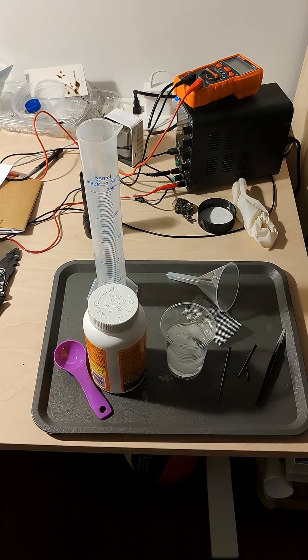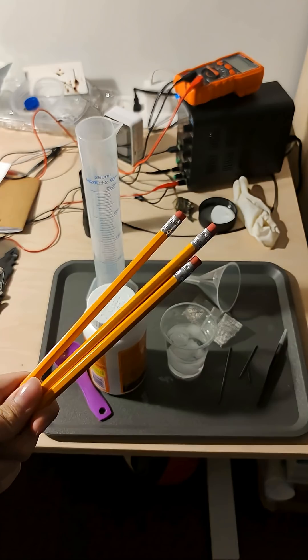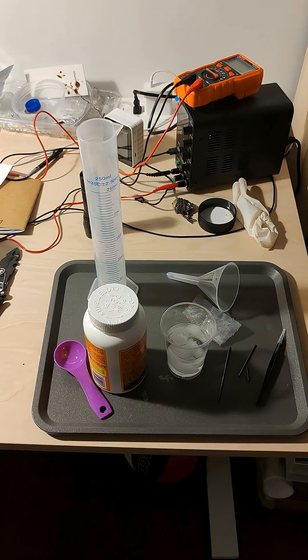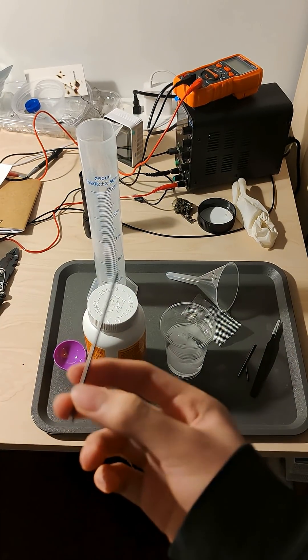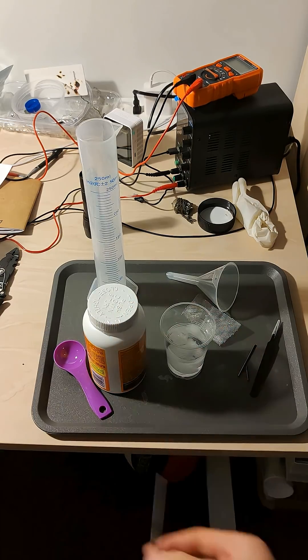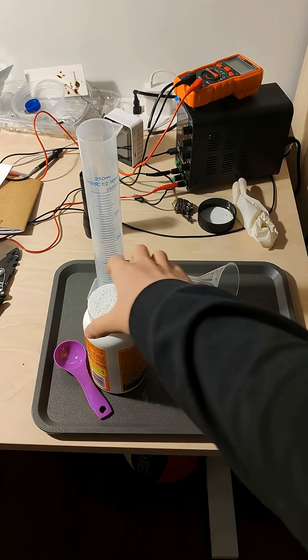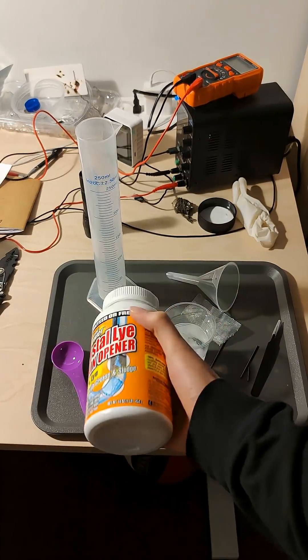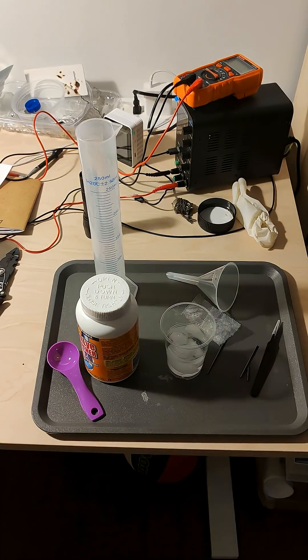Hi guys, today we are going to make some graphite electrodes — not from batteries, but from these pencils, because their core is just so annoyingly graphite rich. And we're going to be turning them into these, by means of your drain cleaner, which just happens to be an industrial wood pulping agent for making paper, so it's like 100% ideal.